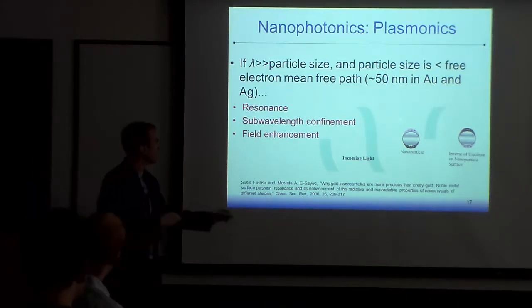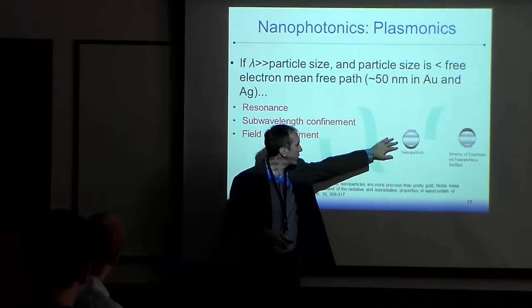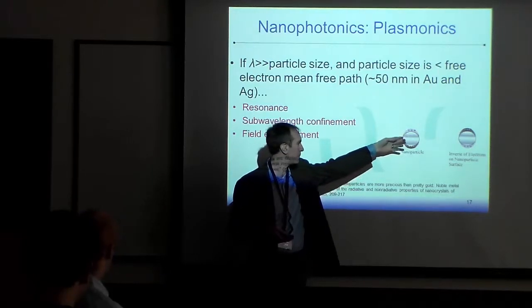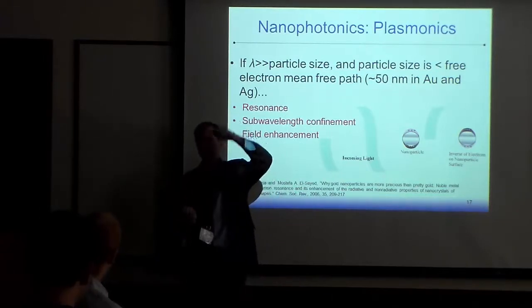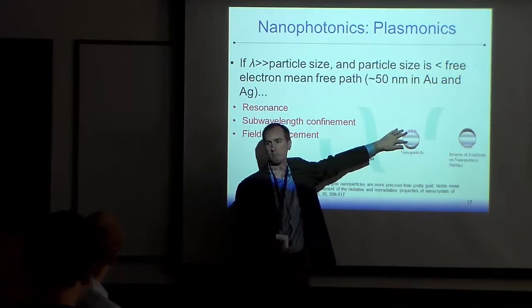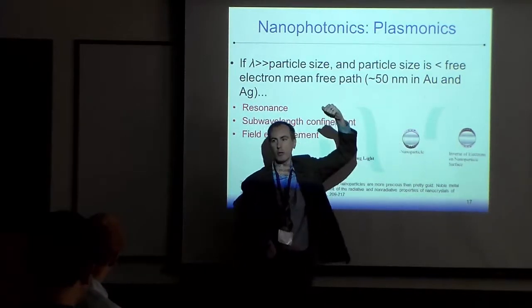Oh, sure. So you want the phase distribution across the nanoparticle? Yes. The red ones are like so much. Yeah. So basically, you can picture this as, in this case here, you're hitting this resonance. It's almost like a static field at this point, because the wavelength is so much longer and this thing's so small. So we're just biasing it, pulling all the electrons to one side and the other side. So across here, it's basically as much separation as you can get for the field present at that time. When you're at the null, the zero point of the electric field, you get no distribution. At the peak of the electric field, they separate out more.